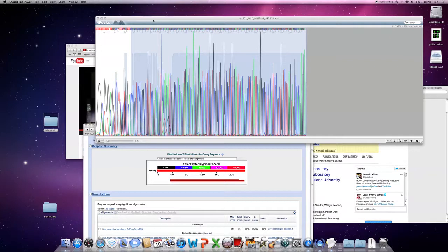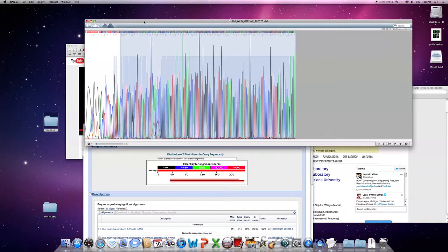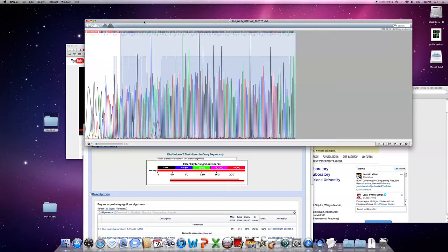Just continuing on the use of 4Peaks and DNA sequencing software. So you get your sequencing back. If you watched my previous movie, you learned how to download your AB1 sequencing files from the Iowa State Sequencing Center and view it with 4Peaks free viewer available for the Mac.